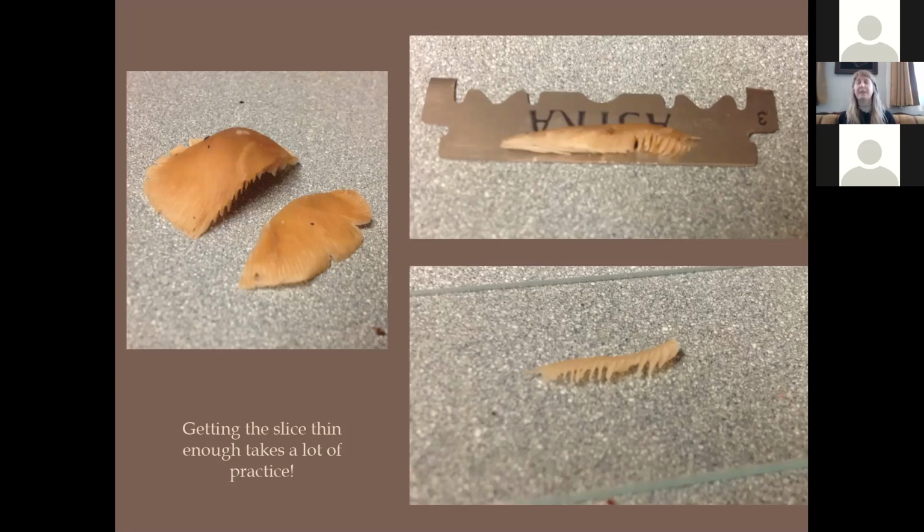But the basic way that it works is that you have two razor blades without any bevels on them, just like the razor blade that's in this photo. And you wrap a piece of clear tape around this part of the razor blade, the unsharp part, all the way around it like that, leaving the bottom part open.